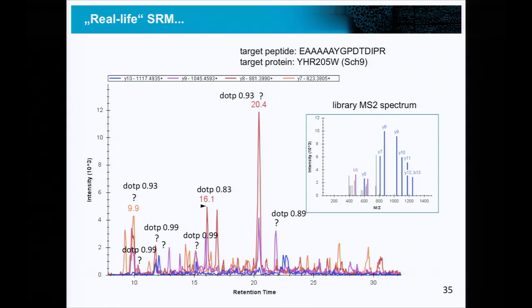That's something that you often see when you have an MS2 spectra with similar intensities of many transitions. This is also exactly what you see with noise, right? Noise is similar intensities of many transitions. So very often you also get good dot products with very noisy data just picked somewhere. So here the MS2 spectra cannot help us. What can we do?